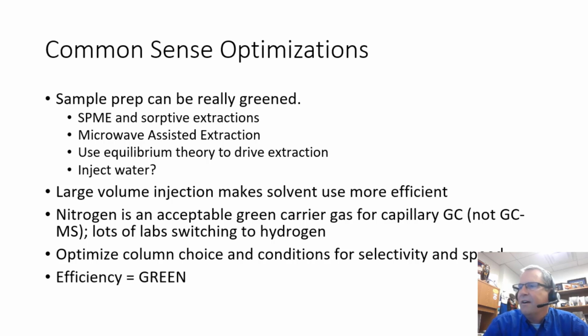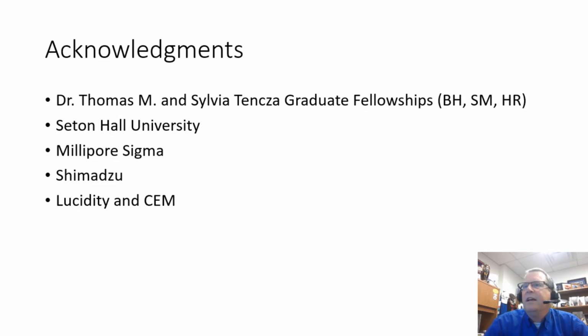Nitrogen and hydrogen, lots of labs are switching to hydrogen. Nitrogen might be acceptable.